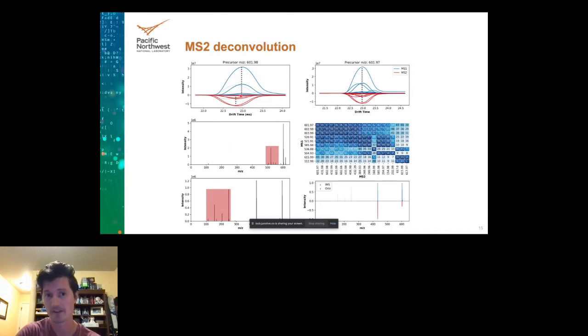You'd presume that these would have exactly the same drift time, but in reality, because of the voltage applied to the collision cell, the MS2 is accelerated relative to the MS1, and so you get this offset in drift time. This happens to be nonlinear. It's both a function of the drift time and the collision energy. We have a pretty cool way of correcting for this, and I think I have a slide on that. I can't quite remember. We'll get back to it if it is there. But here I'm showing a correction of the apices of these unfragmented precursors to where now they're aligned.